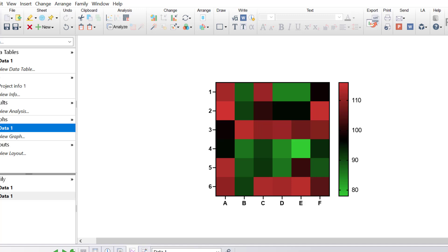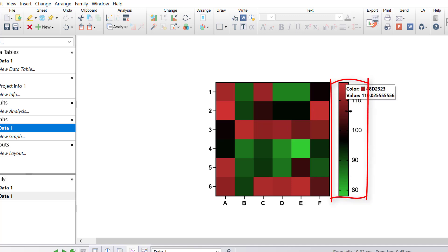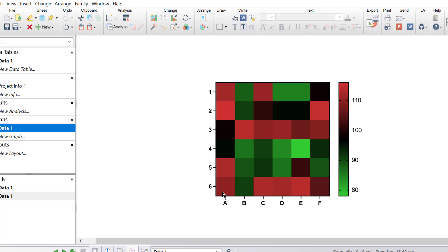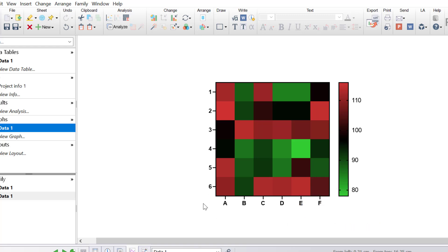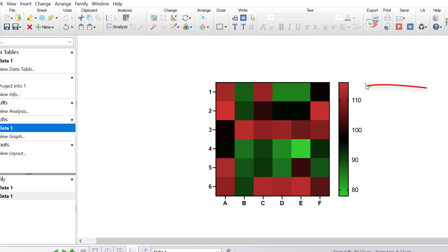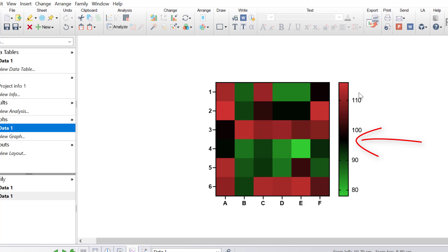Let's explore this heatmap in more detail. The heatmap itself is displayed on the left with the gradient key on the right. Each row represents a different sample or tissue, and each column represents a different gene. The colour of each cell corresponds to the normalised gene expression values from the data table. By looking at the gradient key, green at the bottom of the scale represents the lowest gene expression value, red at the top indicates the highest, and black cells are values in the middle of the two extremes.